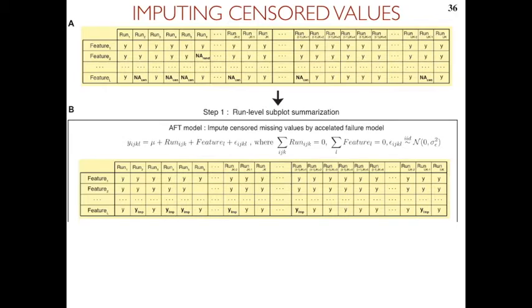And so once we have these values predicted, we still may be affected by outliers. So let's say this particular peak, for whatever reason, was misquantified and it went somewhere here, right? And so now we have a pattern which is very different from the rest of the patterns of these features. So if we now try to summarize this somehow, let's say with the average, it will be very much affected by this outlying peak. A robust summarization instead will say, okay, this is just one number, the majority of numbers are here, and it will lower the summary, so it will also be more resistant to individual outliers. So the first step with imputing missing values focuses primarily on missing values, but it's affected by outliers. The second step will now eliminate some of the artifacts of outlying values.